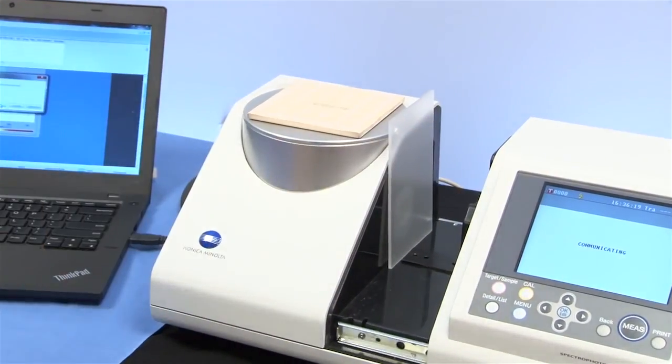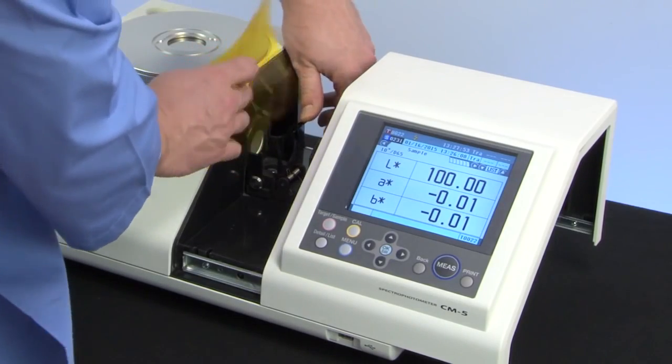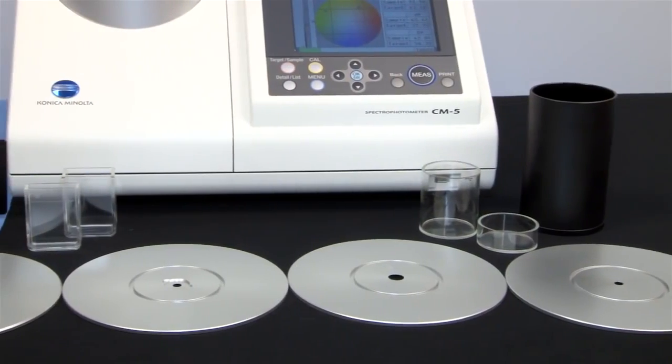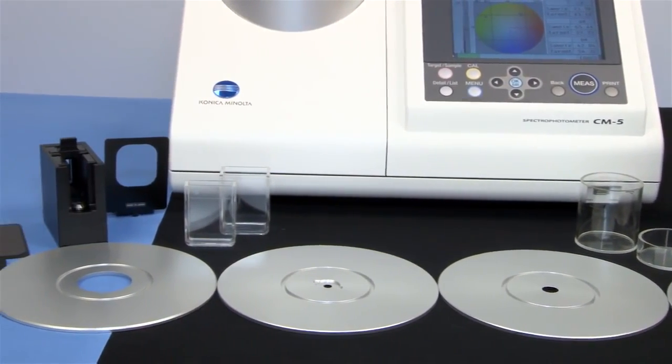The transmittance chamber can hold large sheets up to 60 millimeters thick. A variety of functions and accessories set this innovative spectrophotometer apart.